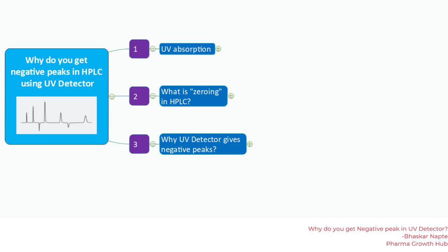Hello and welcome to this video. My name is Bhaskaranapte and today we are going to talk about why you get negative peaks in HPLC using UV detector. One can understand the presence of a negative peak when using a refractive index detector, but negative peaks are not really considered a good chromatographic condition when observed with the UV detector technique. Let us understand the origin of this negative peak — there are three important points we are going to discuss today.